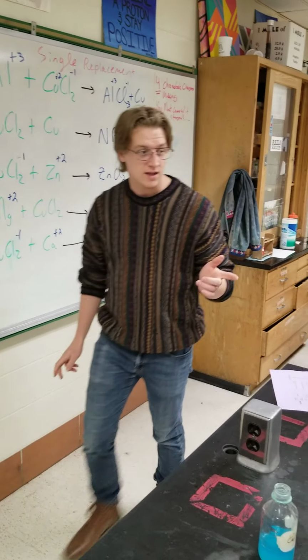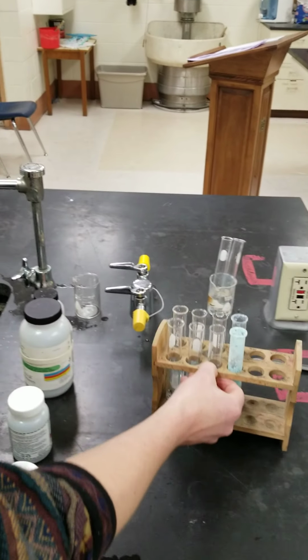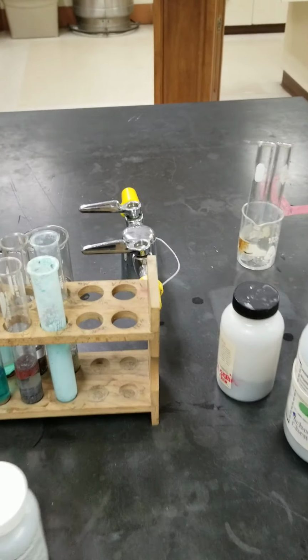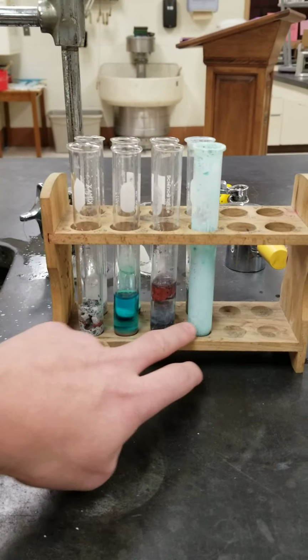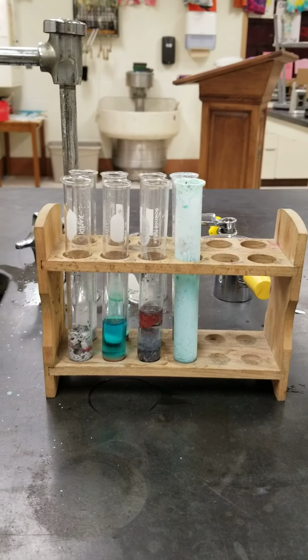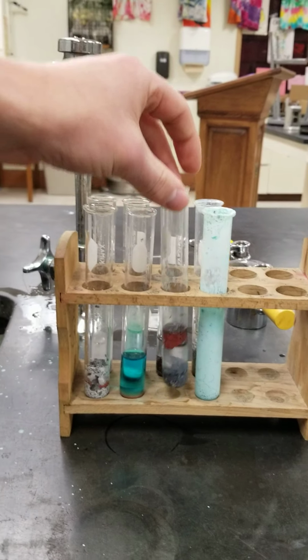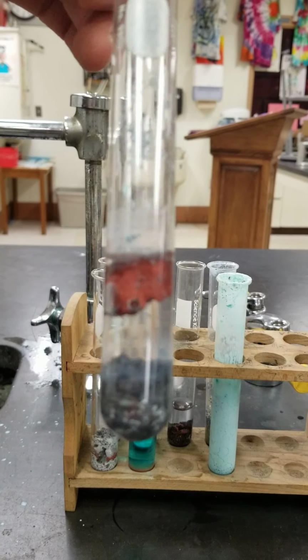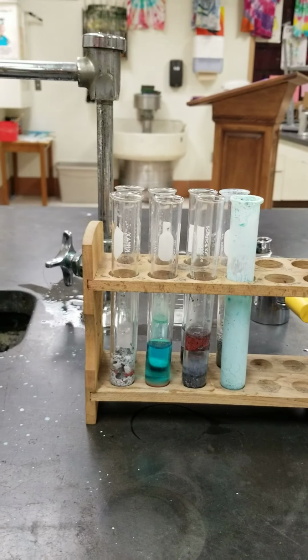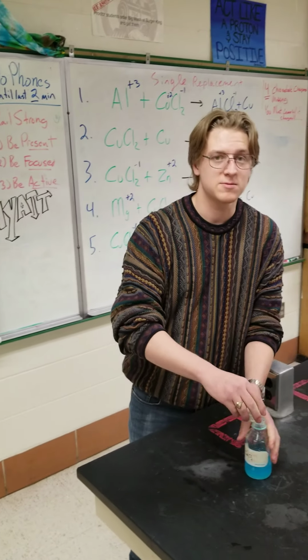Looking over here now, we can see what these look like. These are in the relative same order. This one over here is slightly different. But you can see the difference over time. The one that didn't look like it reacted a lot, the third reaction we did, after a while we can clearly see a difference. And our calcium's still fizzing. But anyway, that's single replacement reactions.